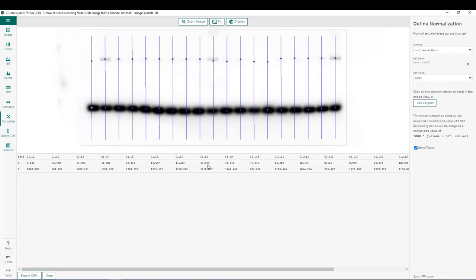In order to export this data, all you have to do is simply choose to copy, and then you can paste into an Excel file.